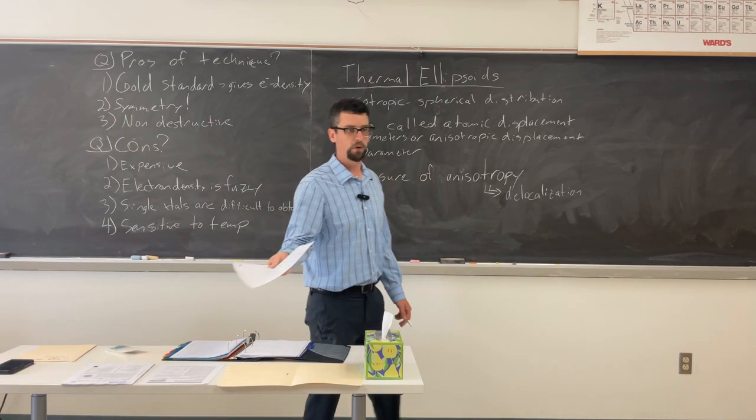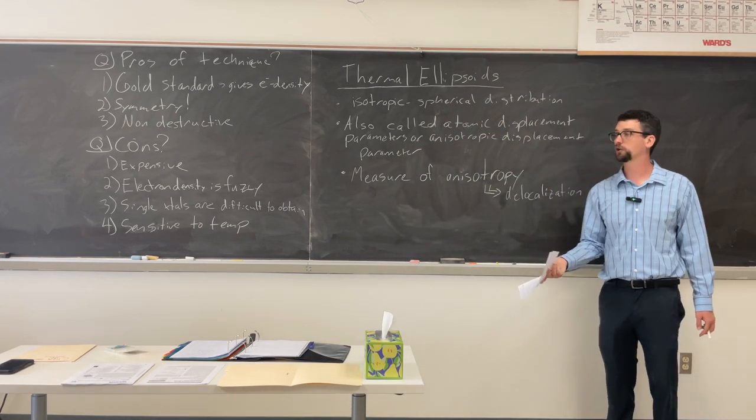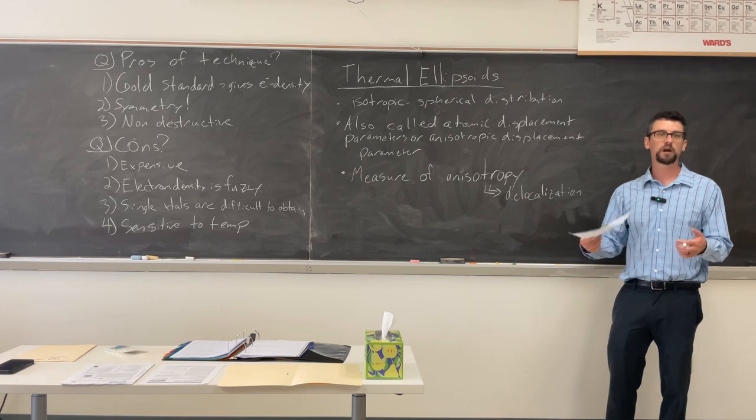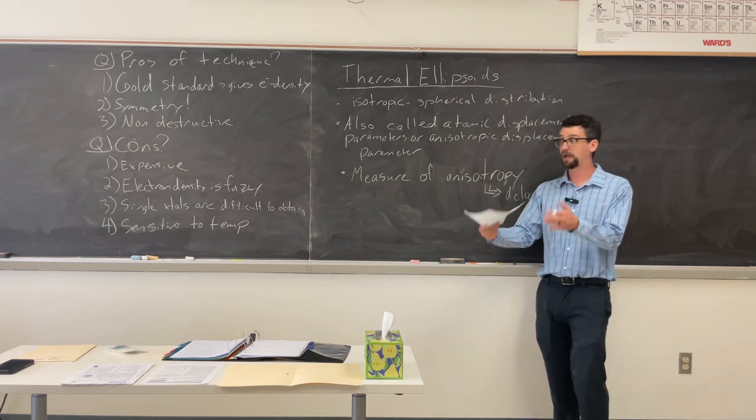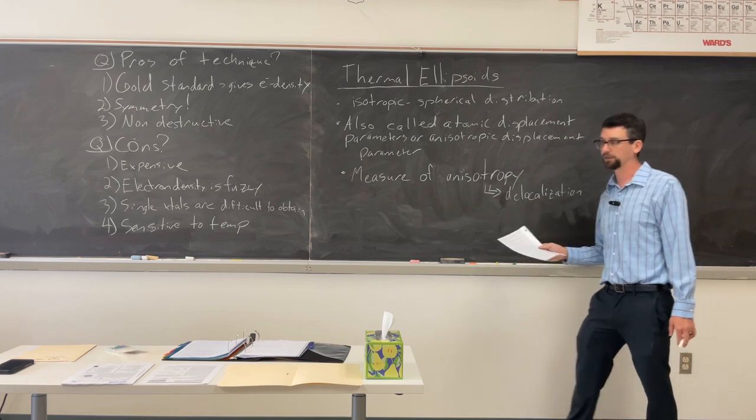A lot of people will publish those pictures with whatever molecule or structure they're considering. And what they're trying to give you is an idea of the atomic positions and the idea of delocalization in those systems.